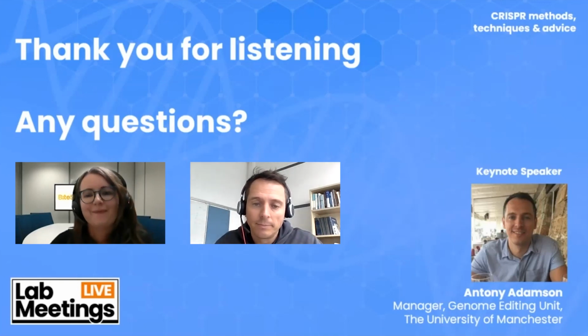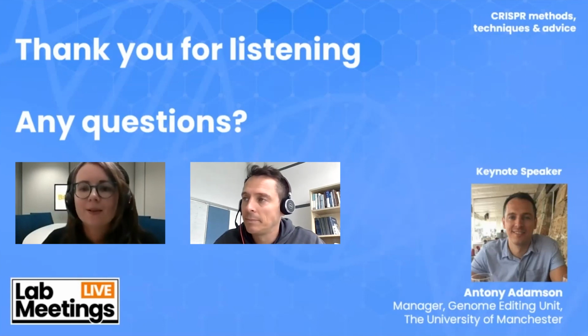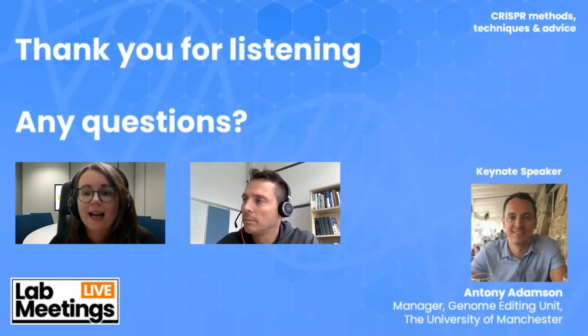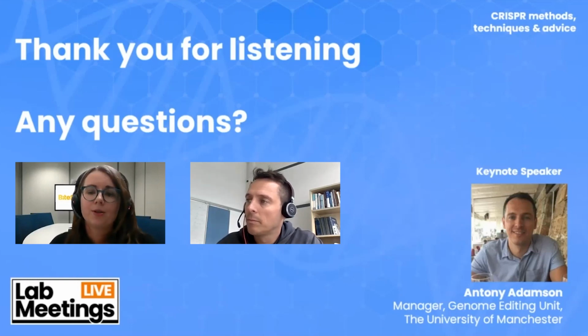Thanks for that answer. The next question we've got is from Pasindu. Are there any other methods of inserting gRNA and Cas9 rather than using microinjection?